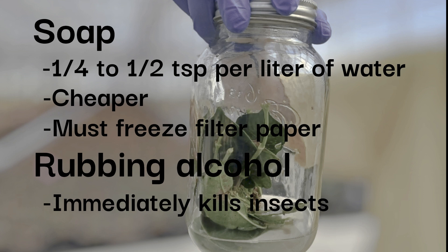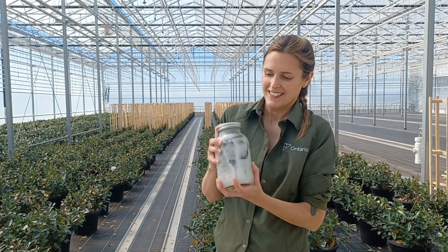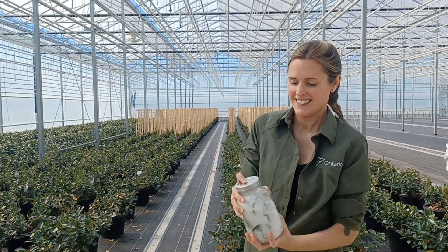If you are using the alcohol method, it is still a good idea to put the filter paper in the freezer afterwards to ensure all insects are killed. Once you have your plant material and solution, tightly fit the lid on the jar and shake vigorously for about 45 seconds.